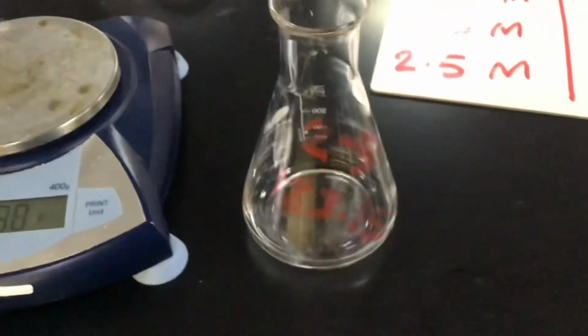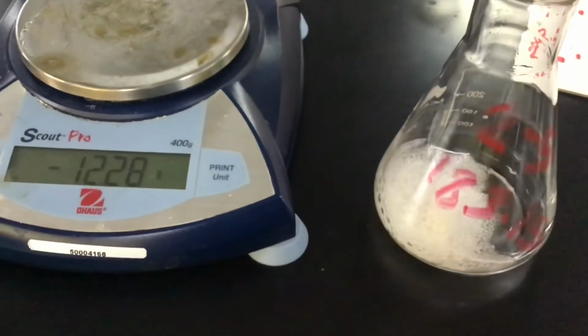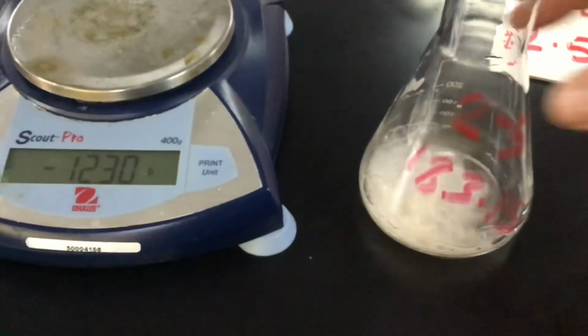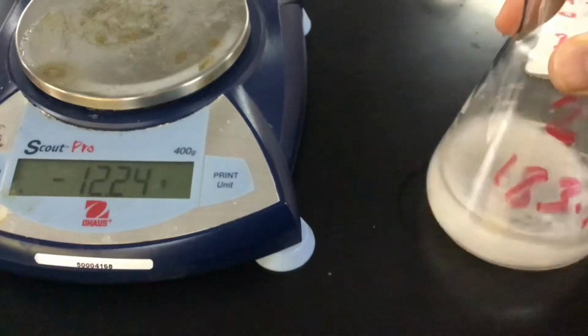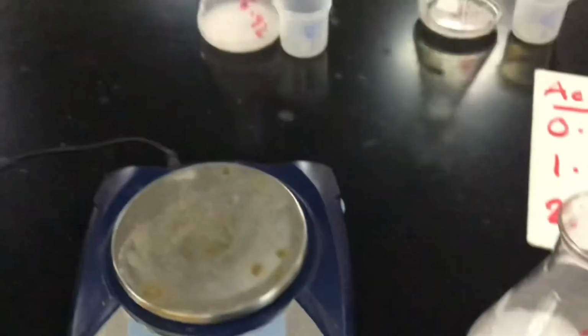So there we have 2.5 molar, 183.15. Pour in the marble chips. Very quick reaction, you'll see. Probably lots more than the others did.